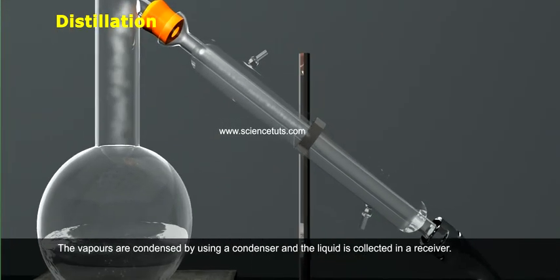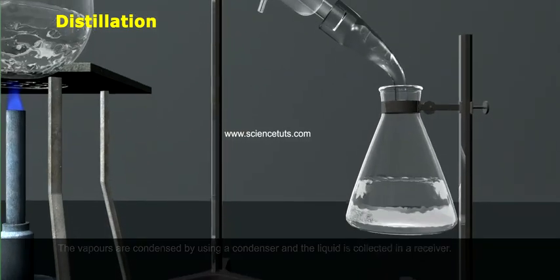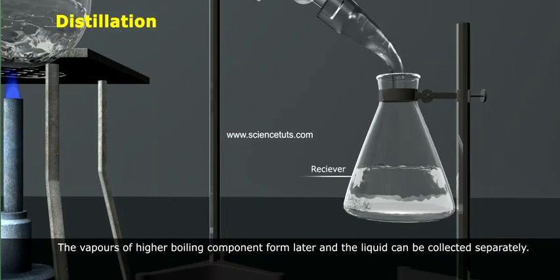The vapors are condensed by using a condenser and the liquid is collected in a receiver. The vapors of higher boiling component form later and the liquid can be collected separately.